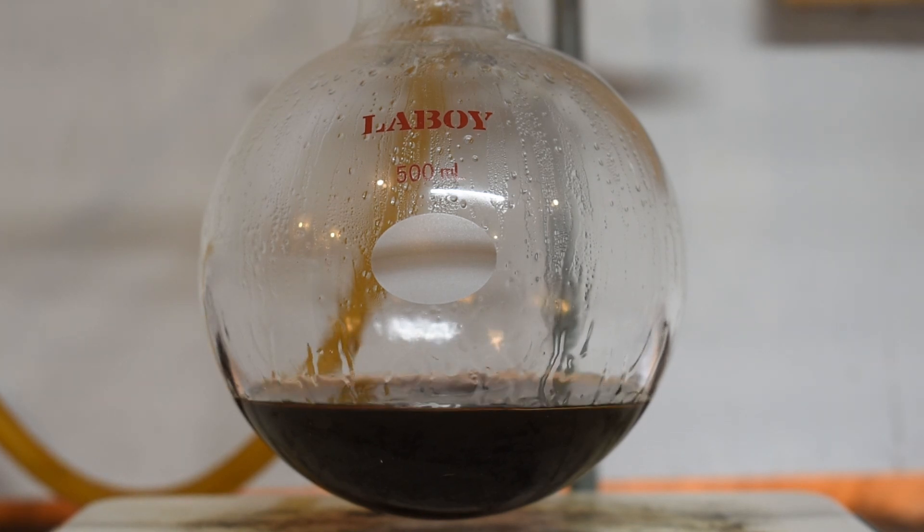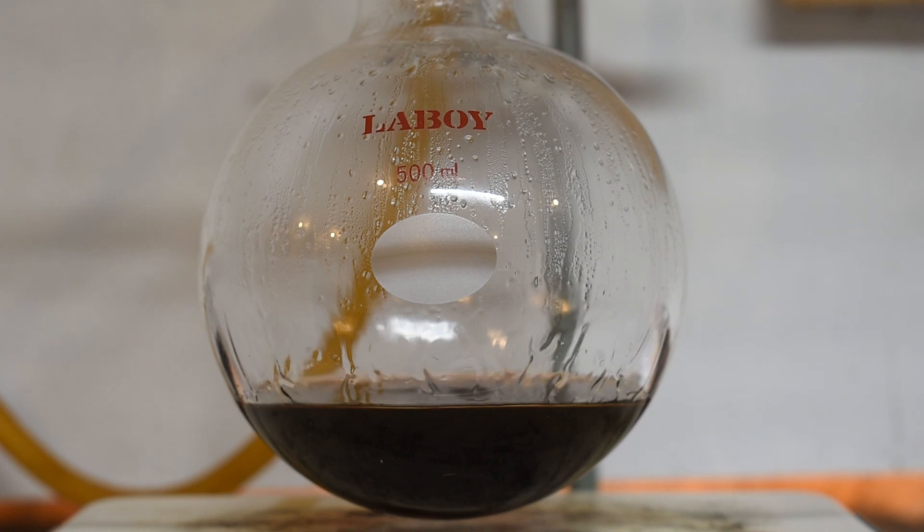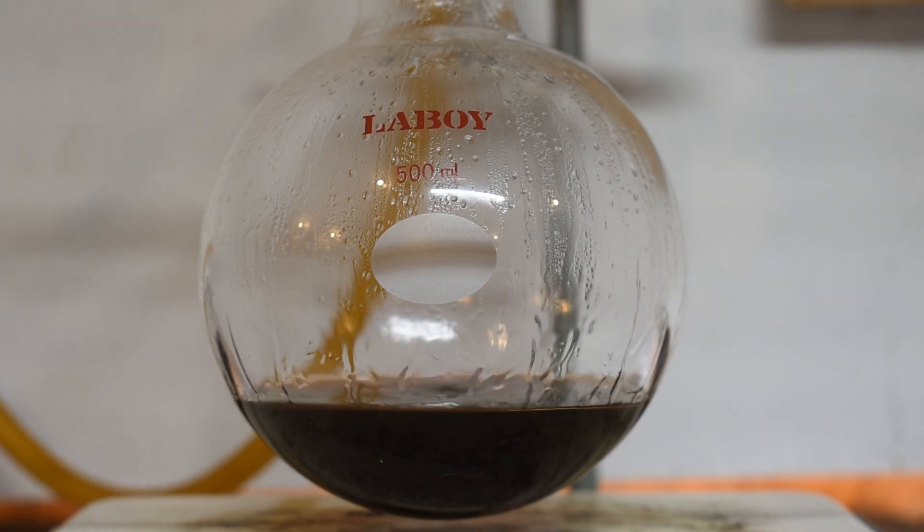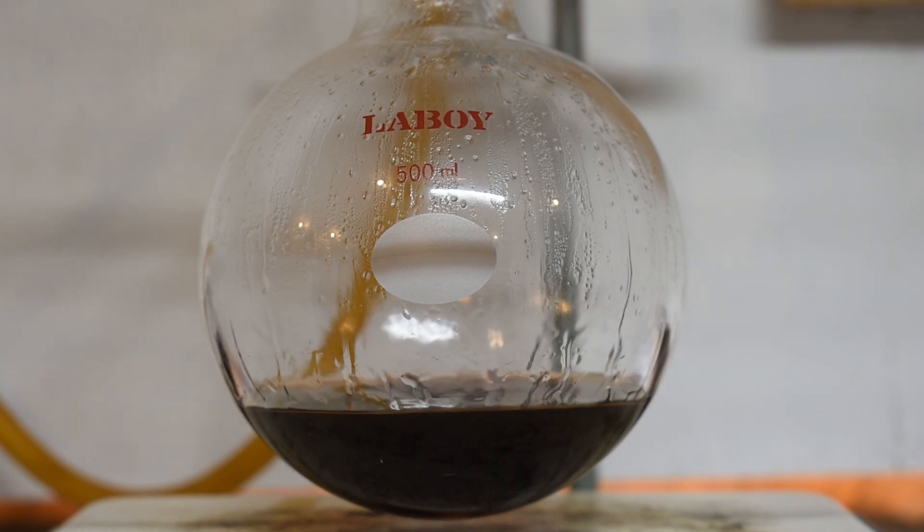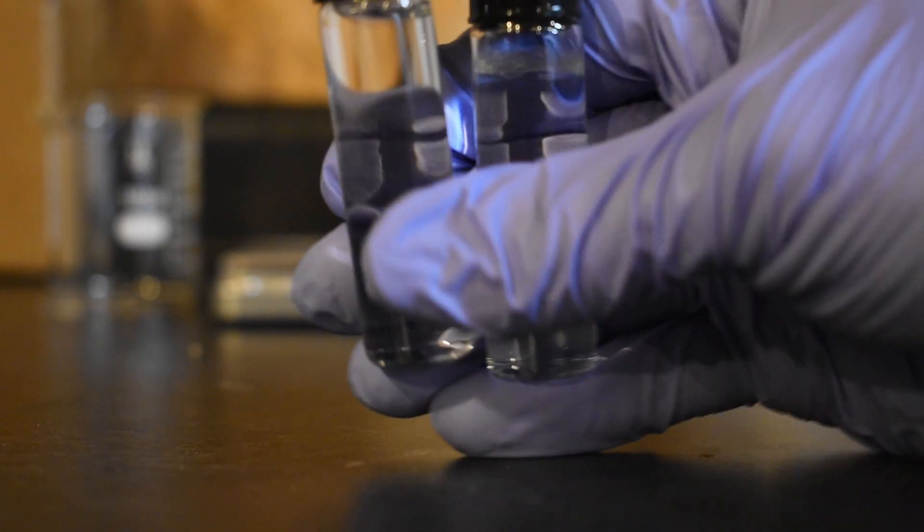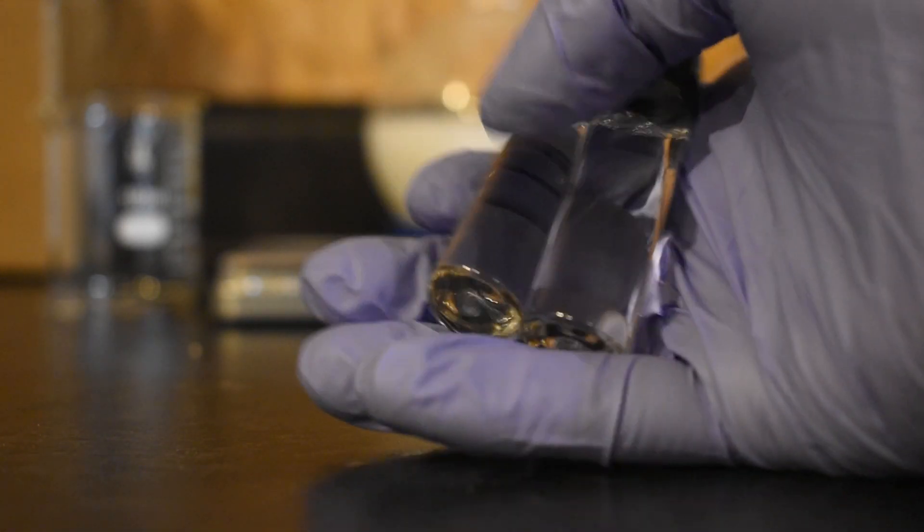In today's video, I'm going to be making isoamyl acetate. This compound is what gives bananas their flavor, and it's also found as artificial banana flavoring in candy. It's also a bee pheromone that's used to signal other bees to start attacking.